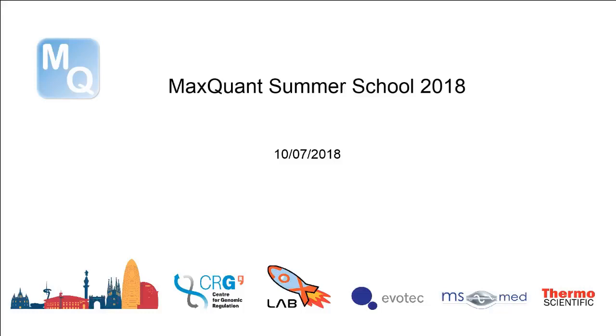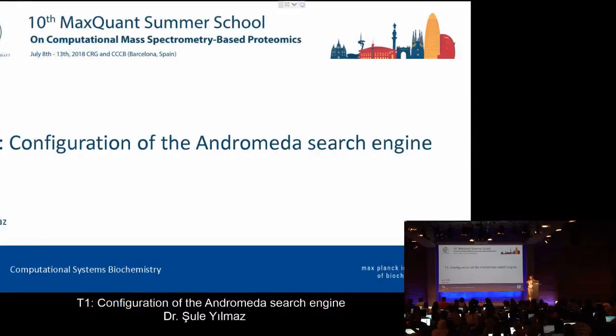So welcome everyone. Today we start the first tutorial, and now we learn how to configure the Andromeda search engine. Throughout the tutorial, you can ask any question to me or any of the MaxQuant team. We are all running around, so you are free to ask any question.